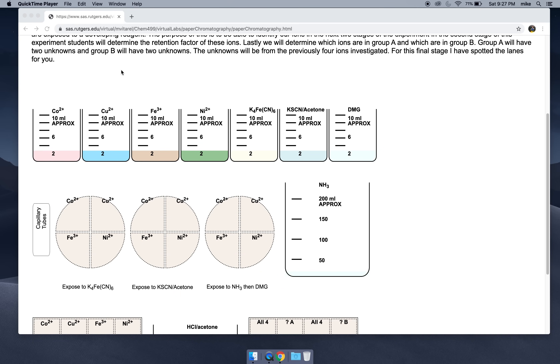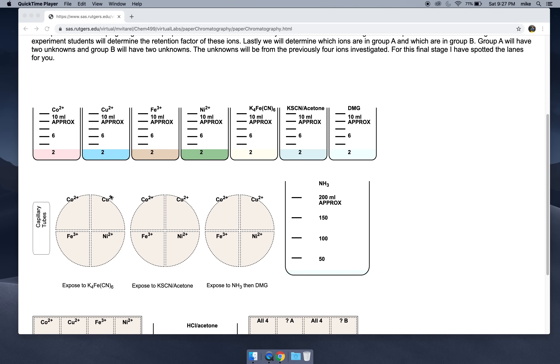There are three parts of the experiment. The first part is a spot test. Basically, we're going to spot these four ions on pieces of paper and then expose them to developing reagents to see the reaction between the ion and the developing reagent. This will produce some color. We'll use that color in the second and third stage of this virtual lab to be able to find the ions. We can't see them originally — the ions are invisible to our eye. The spot just looks like a wet spot.